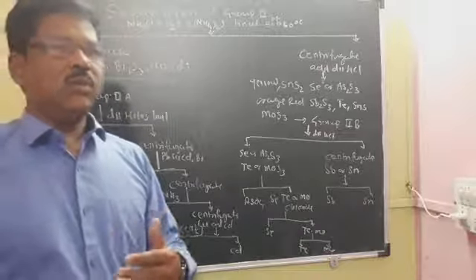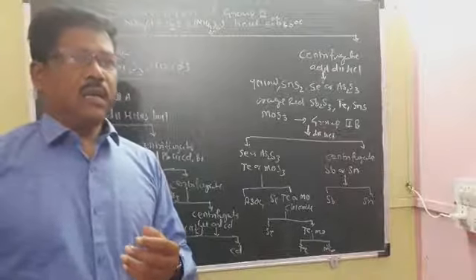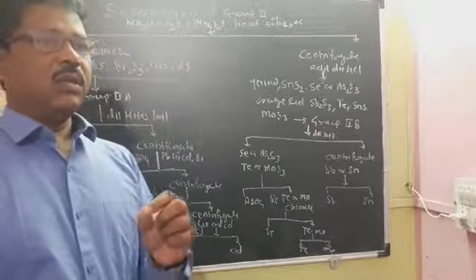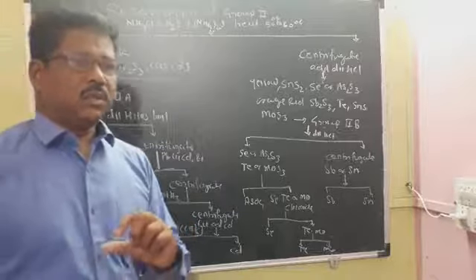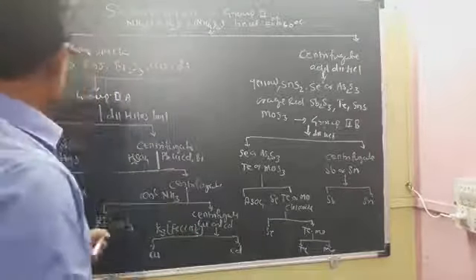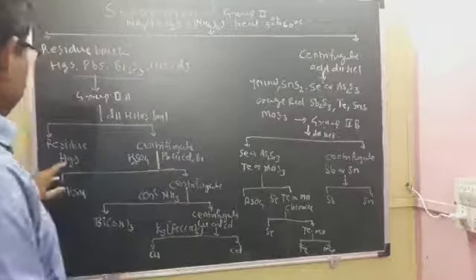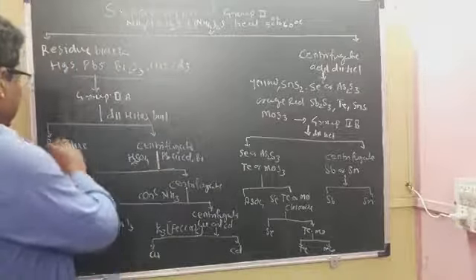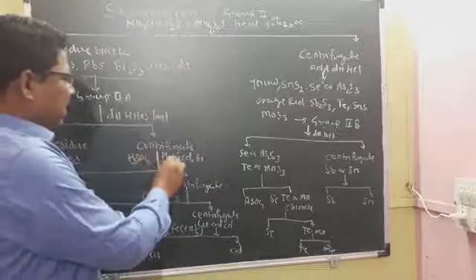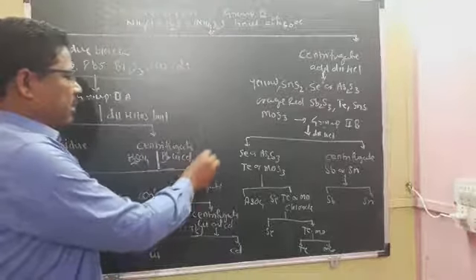Transfer the residue into a small beaker and add 10 ml of dilute nitric acid and boil for about 5 minutes. If some solid material remains, cool and centrifuge again to get the residue, mercury sulfide, and the centrifugate, which contains lead, copper, cadmium, and bismuth.